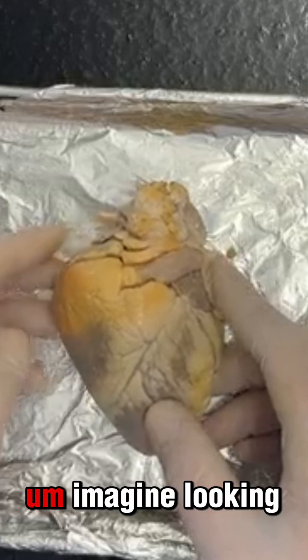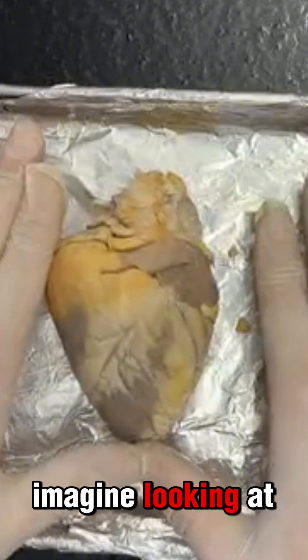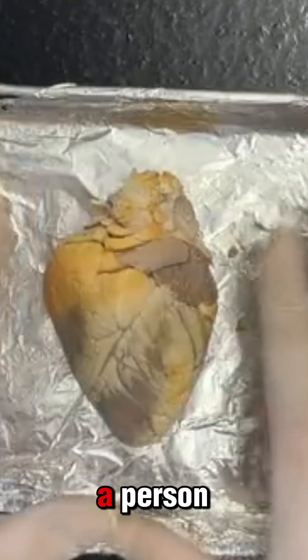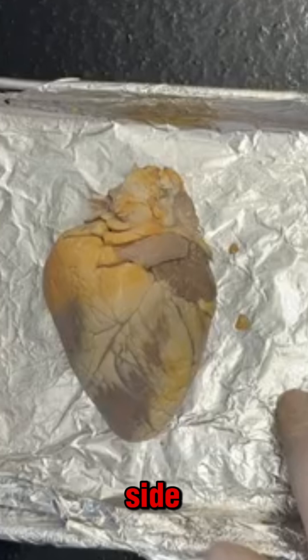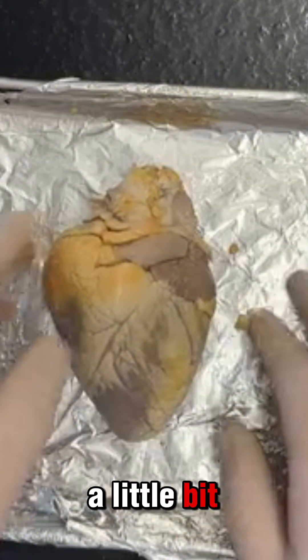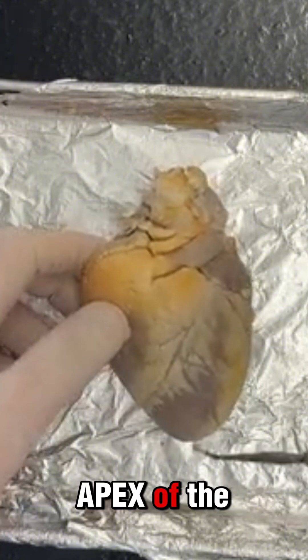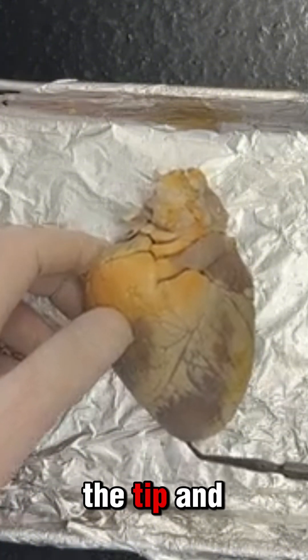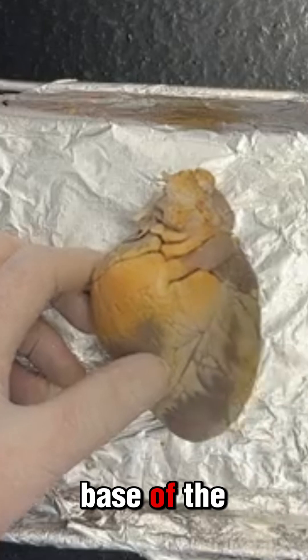This is a sheep heart — imagine looking at the sheep or even looking at a person. This is going to be the right side and this is going to be the left side, so I might throw you off a little bit. Here I have the right auricle, I have the left auricle, I have the apex of the heart — the apex or the tip — and then up on top here I have the base of the heart.